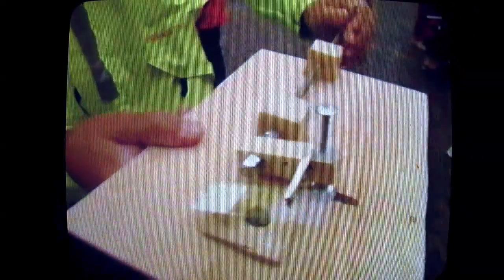Here is a blob of glass, and it's clamped between this sheet of wood and this sheet of wood. And if I look through there, what I can see is actually a whole lot of greeny blue blobs. I think you'll be able to see them too, and they're actually algae. This is more or less like his. Do you see the lens is that tiny, tiny thing in the middle? If I hold it up to the light, what I can see is a lot of filaments, greeny blue filaments, which are actually filamentous algae.